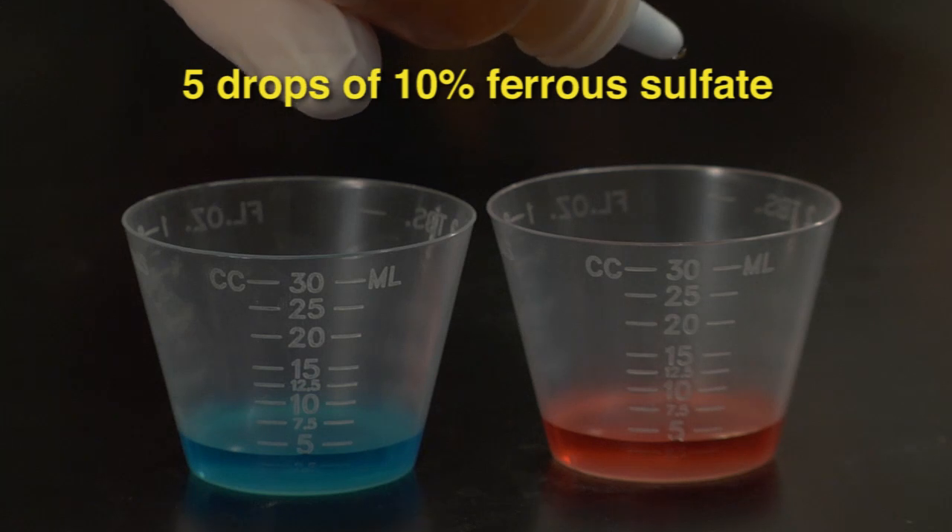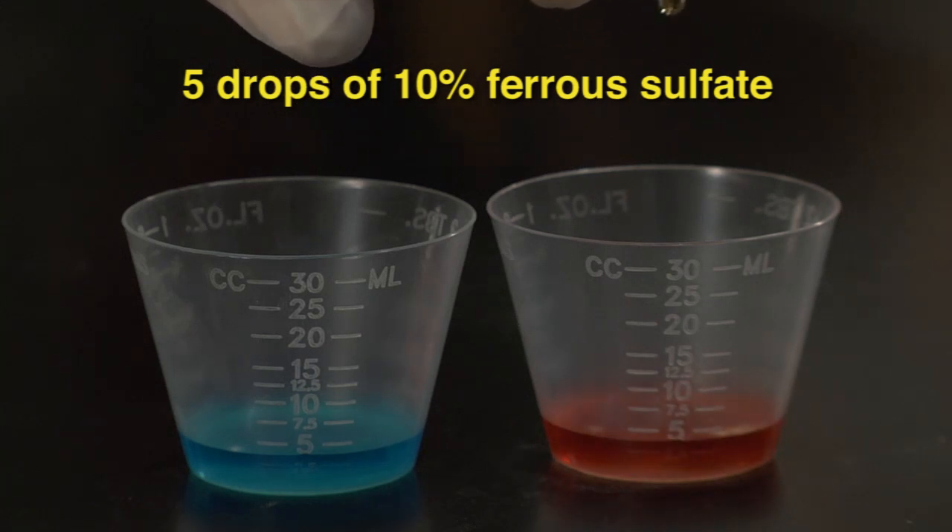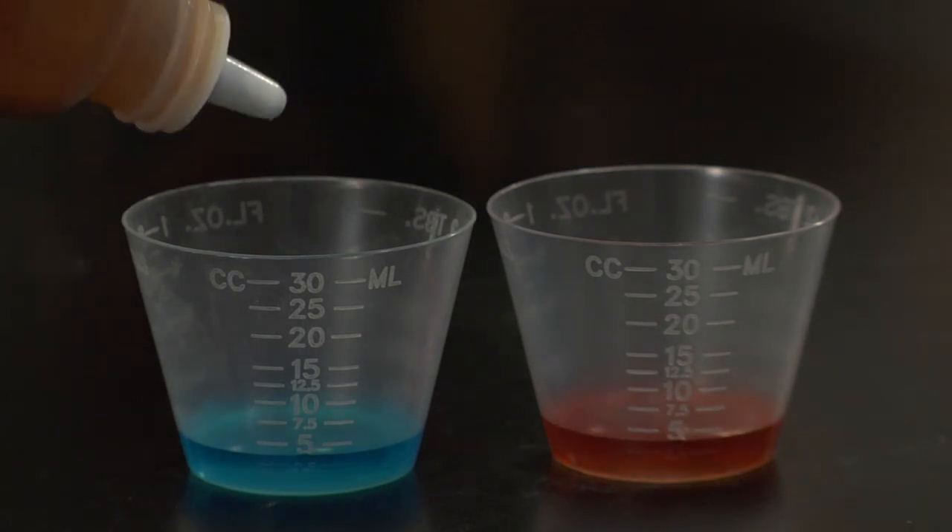Next, we add five drops of 10% ferrous sulfate to each beaker. Afterwards, we swirl each beaker again to mix it up.